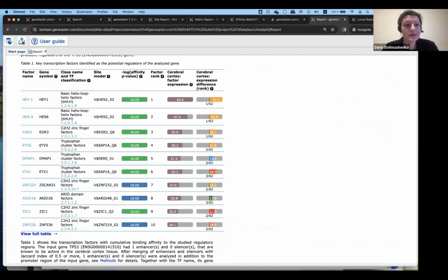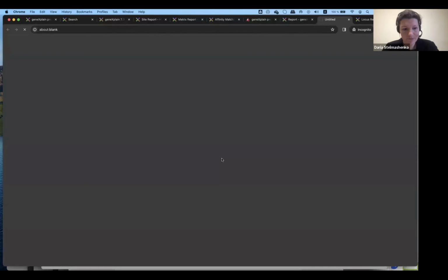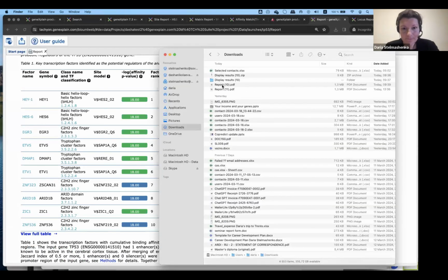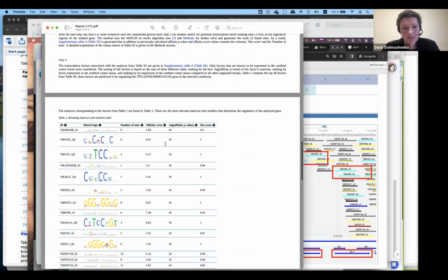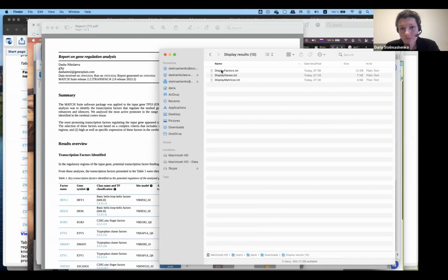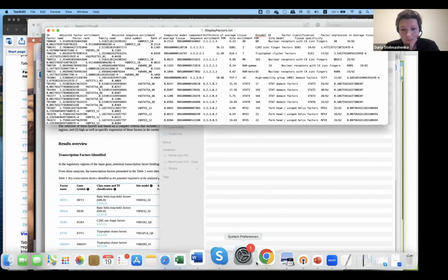The report, of course, can also be exported, and you have a selection here. It can be exported as a PDF document. Then it is just a static PDF, like what you would expect from any PDF, which would be hard to copy in terms of text and images. And by the way, here is how the displayed tables would look if we have exported them. Factors, genes, and matrices are all independent tables, which you can then further work with. This is when you apply the filters, as I was showing you.